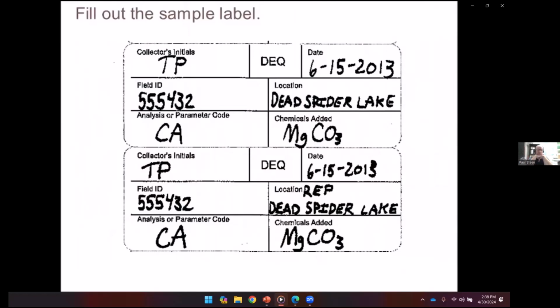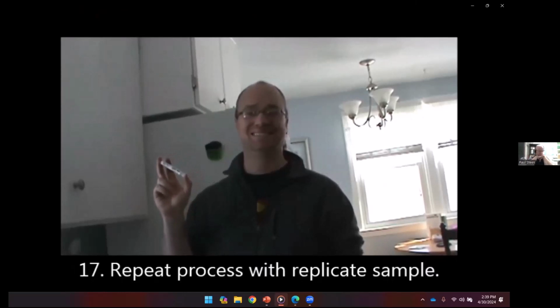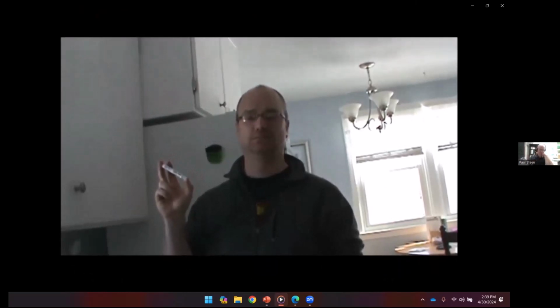On the label for your second sample, write REP next to the lake name. This is short for replicate. You now have one sample complete. Congratulations! Now you get to do it all over again with your second sample bottle.